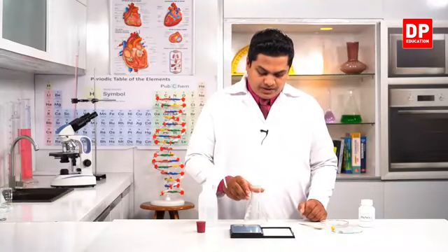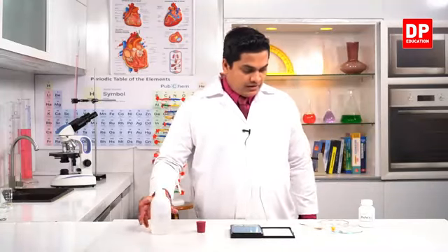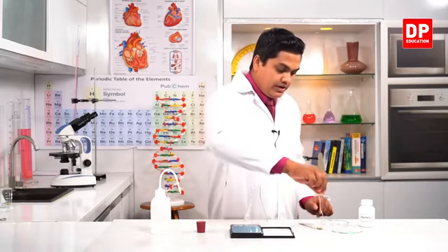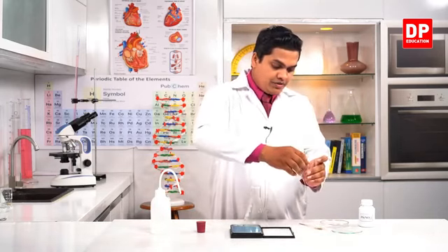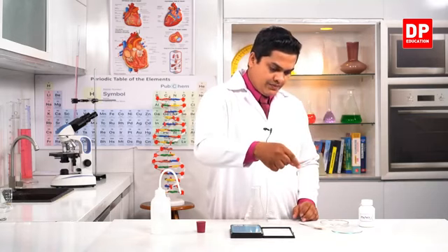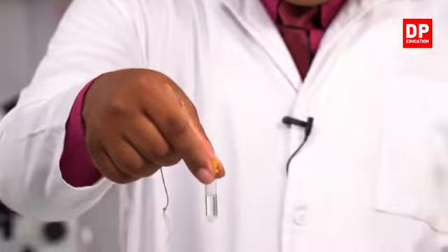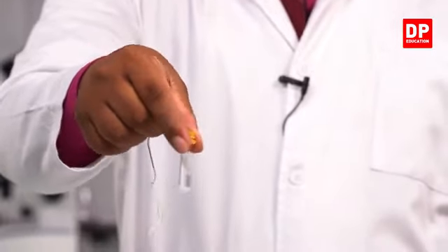So now I'm going to keep it here. Then I'm going to take the earlier ignition tube which has sodium chloride. Here you can observe there is still some sodium chloride at the bottom, so I'll shake it somewhat.